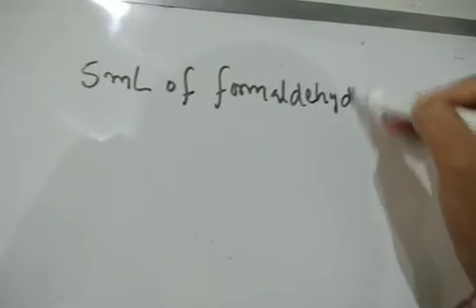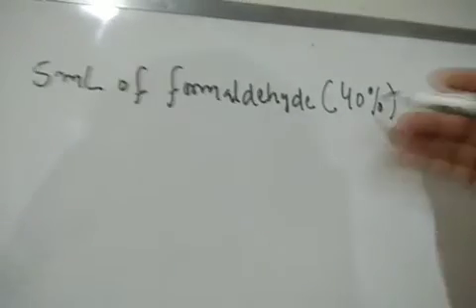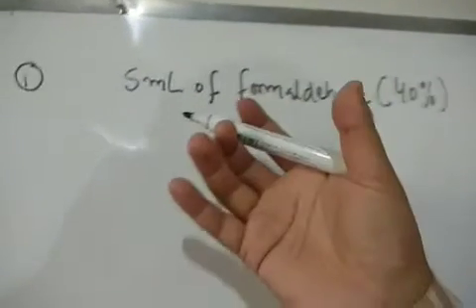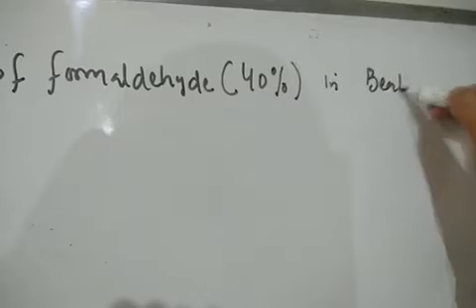And that formaldehyde should be 40%, which is already available in the market. Take that in a beaker. Once you have measured that in a beaker, that is your step number one.